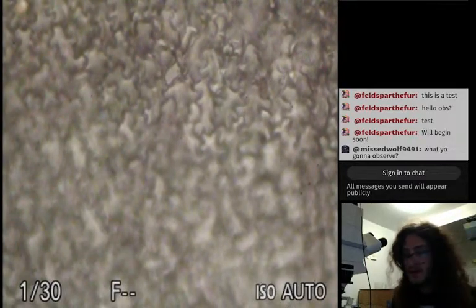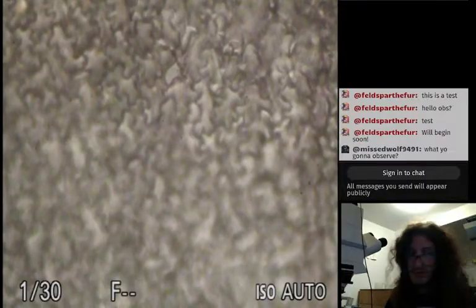Alright, let's see. Next up, we shall view the dandelion. Actually, no, wait, let's zoom in a little bit. Let's zoom in. Why not? I'm here all night. Oh, what's this thing? Not a creature.